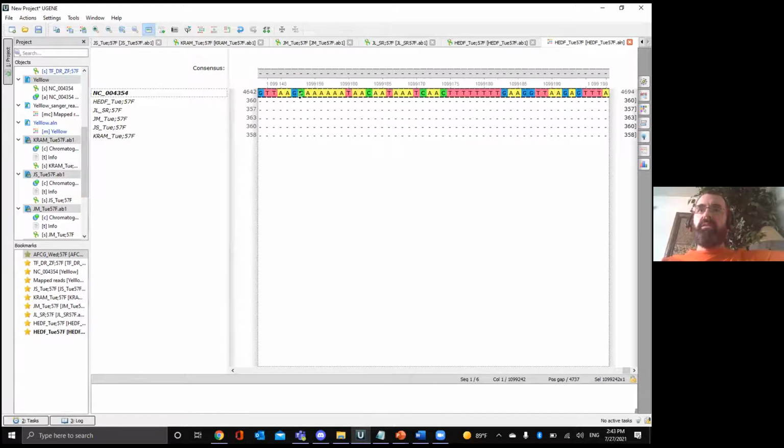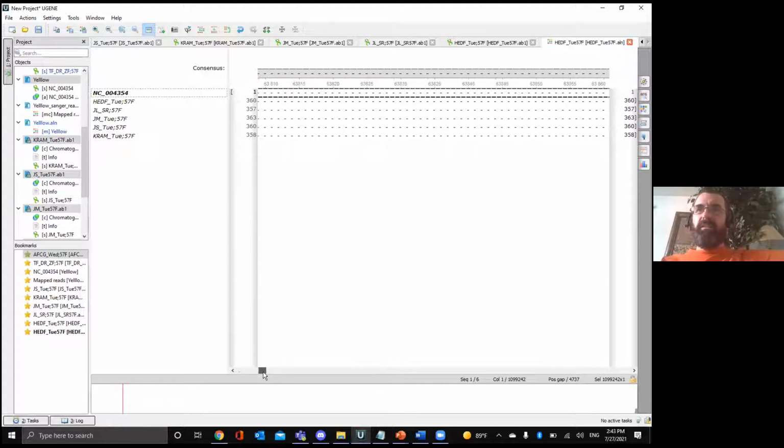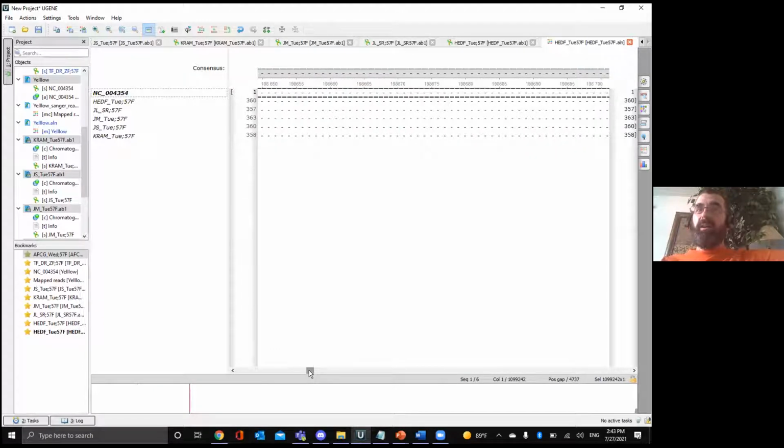Okay, all right, so you need to go all the way back over to the left. You're on the tail end of the sequence there. At the bottom, you'll see there's a slider box. Just grab that gray box and then just drag it all the way over, and then a little bit back. What is going on with your... There's nothing. Oh, that's weird.